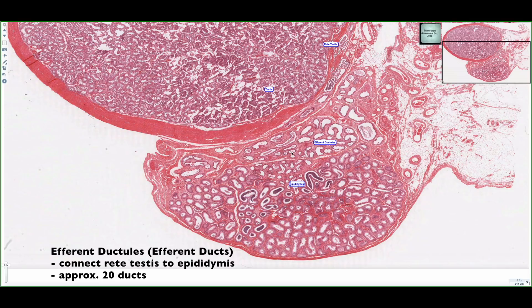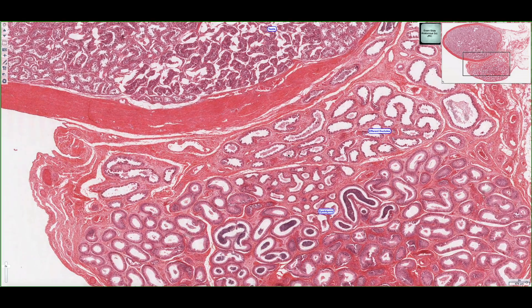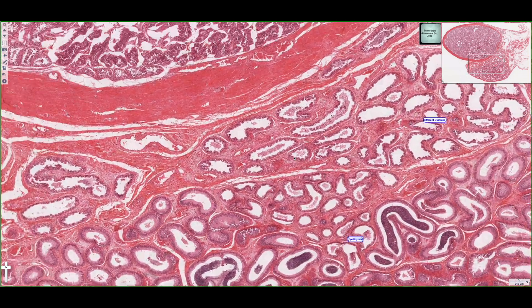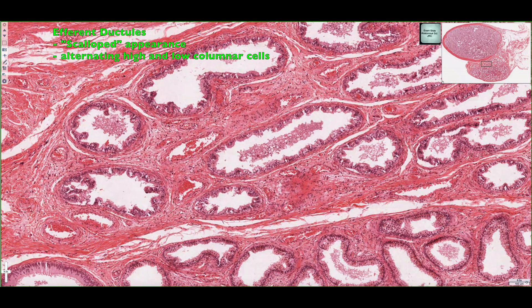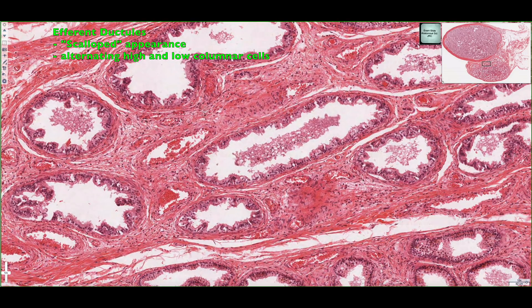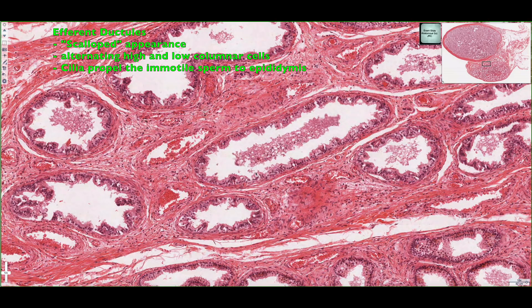The efferent ductules in man — there are approximately 20 of them — connect from the mediastinum testis, where the rete testis are found, to the epididymis. The efferent ductules have a characteristic scalloped appearance, meaning alternating high columnar cells with low columnar cells. At the apex of these cells, cilia help move the non-motile sperm towards the epididymis.